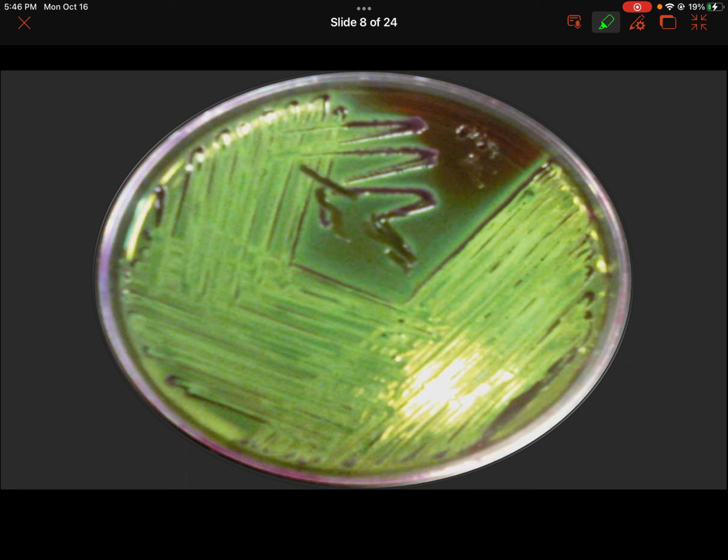Another thing, you have here a multiple interrupted streak. However, this method is not that good because, aside from the fact that this agar is corroded, this one doesn't have single colonies, so you cannot pick up one single colony to do the biochemical testing, for the identification. But what I am trying to project here is that sometimes you might observe unique characteristics of the microorganisms. In this case, this is a greenish metallic sheen from Escherichia coli.